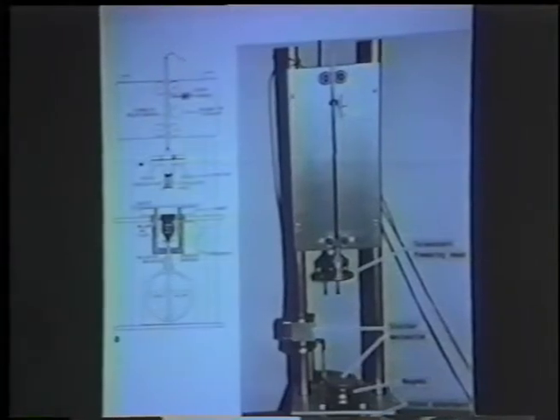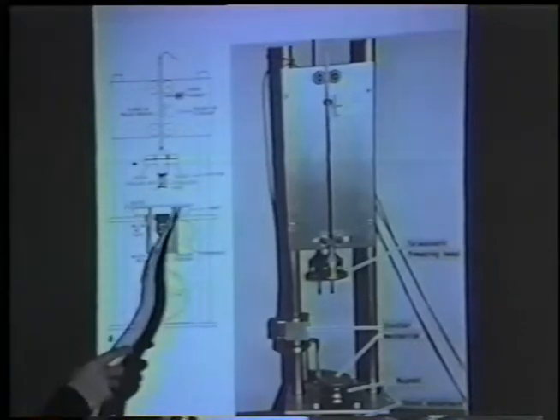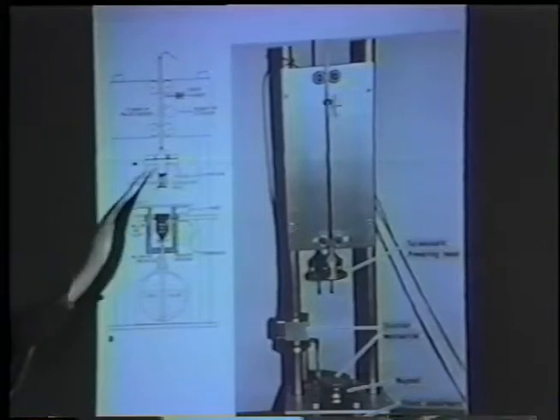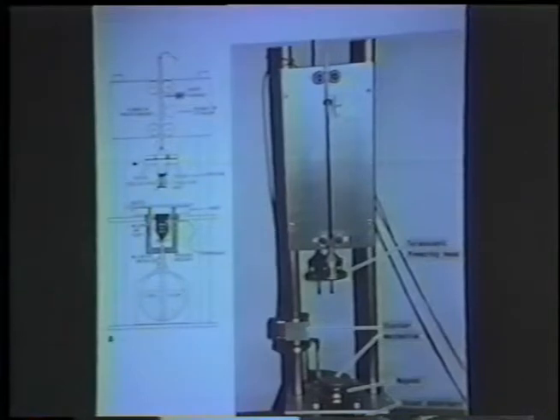Okay, what else can I tell you? Okay, in this system, the mechanism for preventing rebound is an iron ring that is captured by a magnet down here. That plus an optimally tuned system, shock absorber, the film or whatever you're using to back the system and keep it from being crushed. So if that's optimally tuned, then you get no rebound, at least no evidence of rebound. And you also get no crushing of the sample, no shearing of the sample.